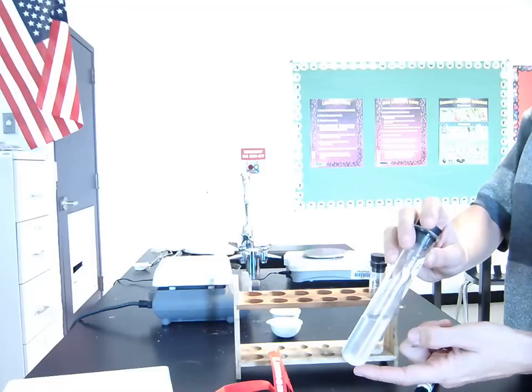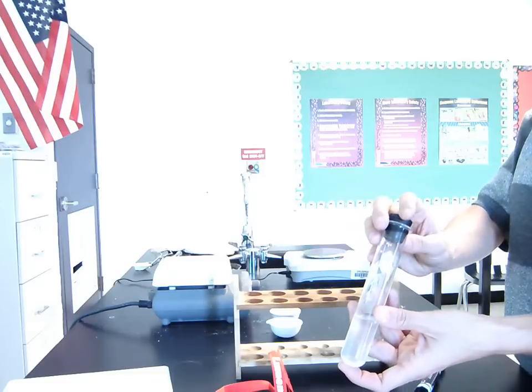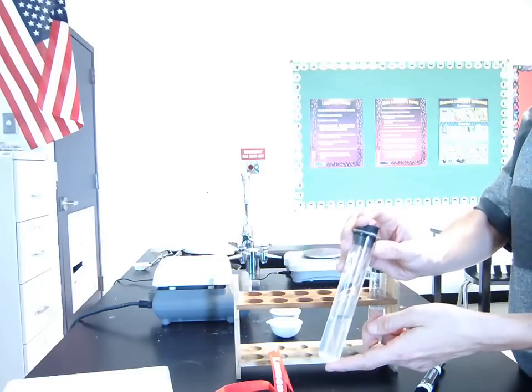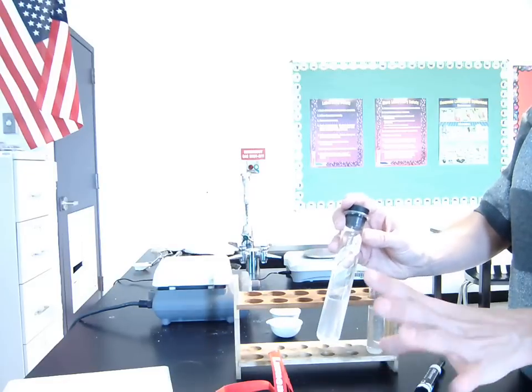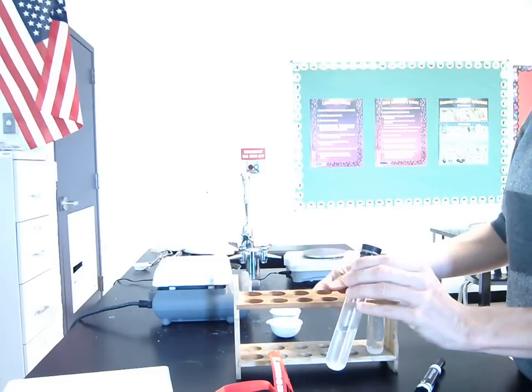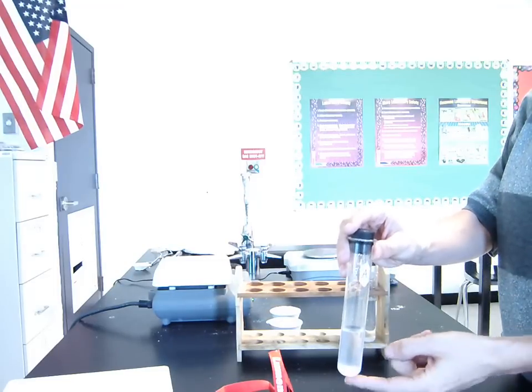You can see at the bottom here, there's a lot of solid that's left undissolved. So what we did was I probably used about 20 cubic centimeters of water, and for substance A, it's probably about 10 grams of substance A. And I shook it up for quite a while. I did this already just to make the time go a little faster on the video. I shook it up quite a bit, and so I know that this is saturated because I can see that there's undissolved solid left in the bottom. So you guys can see that down here.